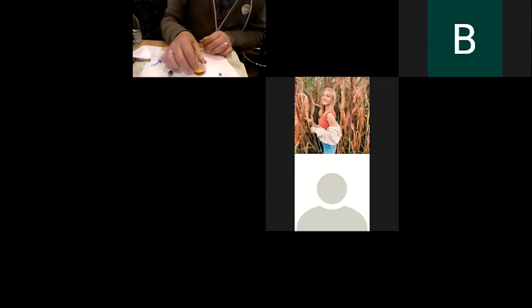So what I'm going to do, I'm going to try this again with half a mil and see if it works any different. Because I think what we're looking for with a high concentration of vitamin C is this bright yellow color, because it wasn't this color when we started. So let me try that again with a smaller concentration. It's a good thing I did this first, because that would have been very confusing. Because it says to look for a green color, and I don't think it's a green color we're looking for. I think it's that gold color.